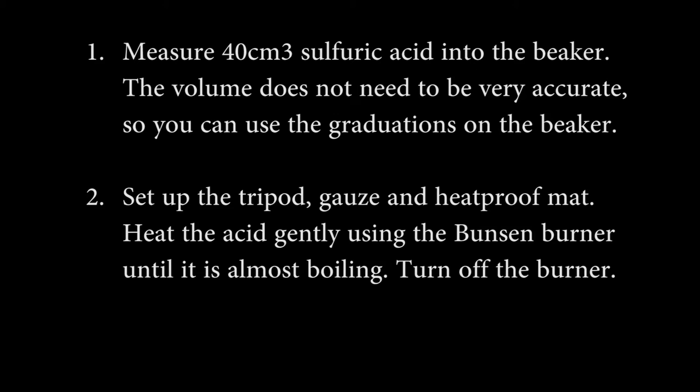After that you're going to set up the tripod and gauze and the heat proof mat and heat the acid gently using a Bunsen burner until it's almost boiling. Once it is almost boiling, you need to turn it off straight away. We don't want acidic fumes in the lab so don't walk away from it, it's hot acid.